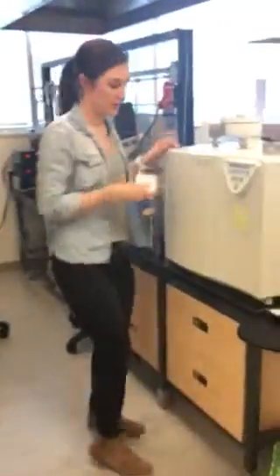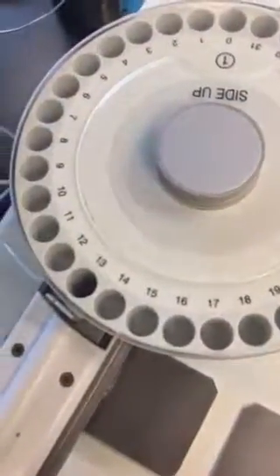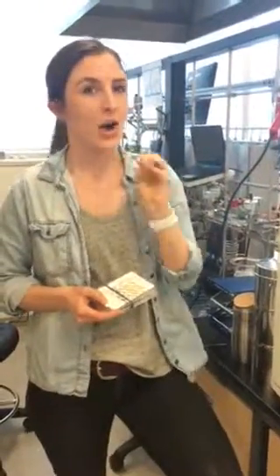So in here, can you stand up and just zoom down on the top of the EA? We put the little tin capsules into this auto sampler, and then they drop down into a furnace and they combust at over 1,000 degrees Celsius. That gas is then purified to remove things like chlorine and sulfur and water and oxygen. Sulfur is the most important thing to remove because in the next step we're going to be getting the carbon from the CO2, because now we're a gas.